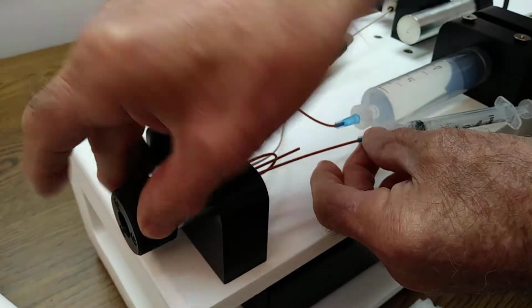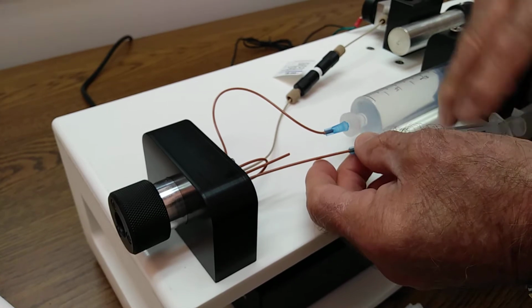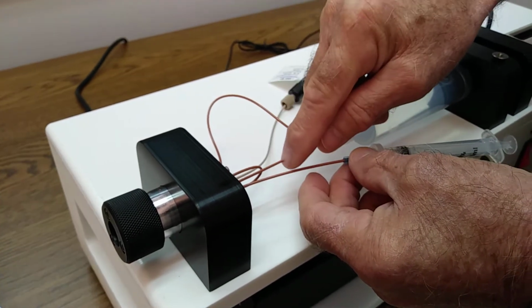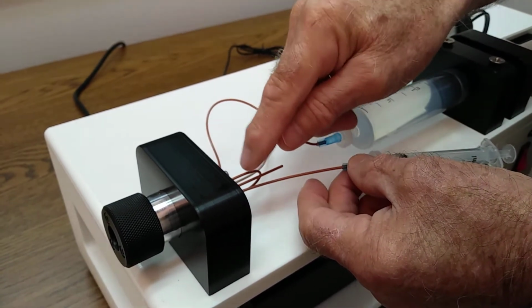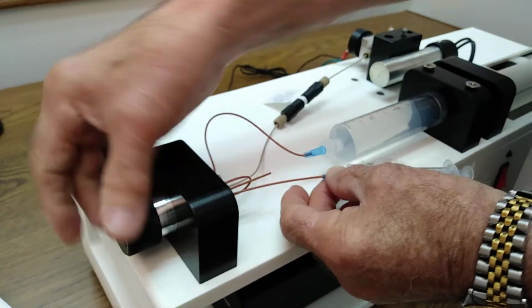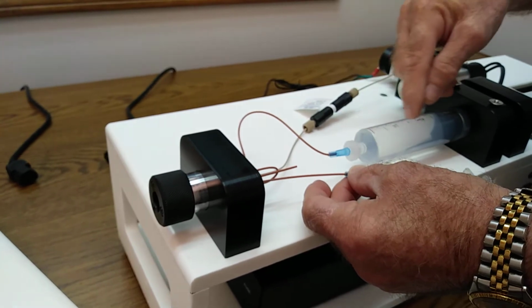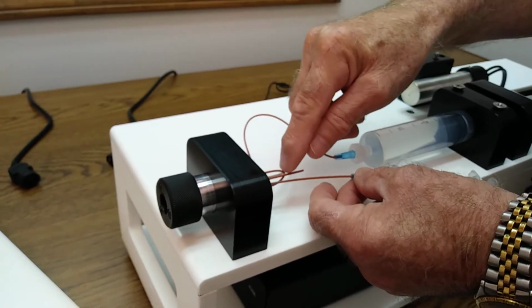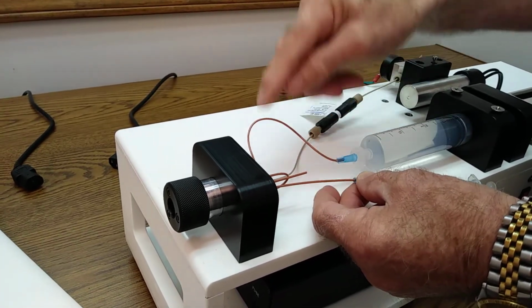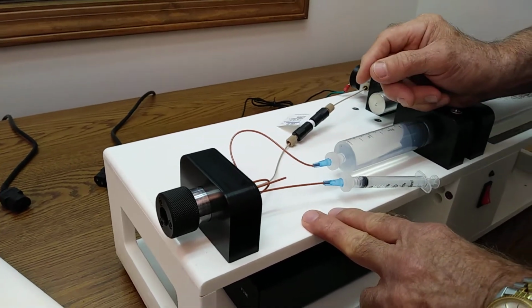So with the injector rotated back this way toward us, when I push on the syringe here, the flow goes in, goes inside the valve, goes through the loop, and comes out the top and drips. That's the way you load a sample into the instrument. And to inject it, I rotate this valve forward away from us. In this case, the eluent from the syringe flushes through the injector loop and out onto the column, thereby putting this 10 microliters into the column. So we've accomplished the goal of measuring the amount of sample.